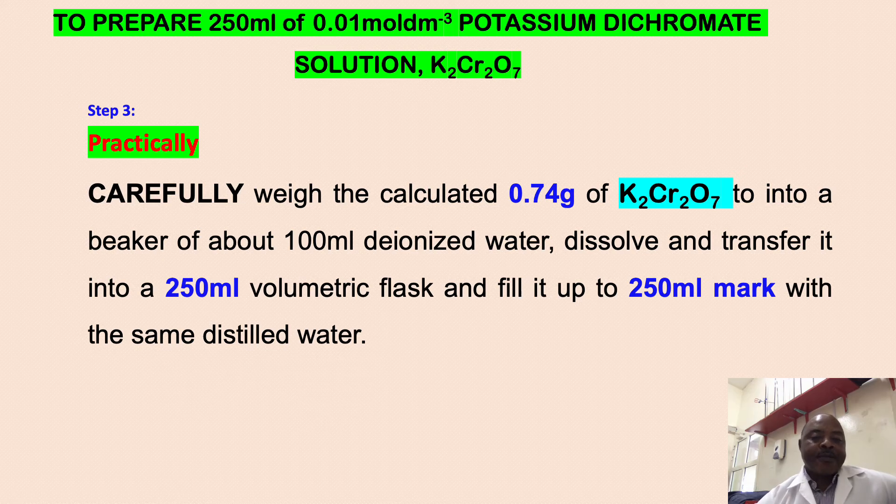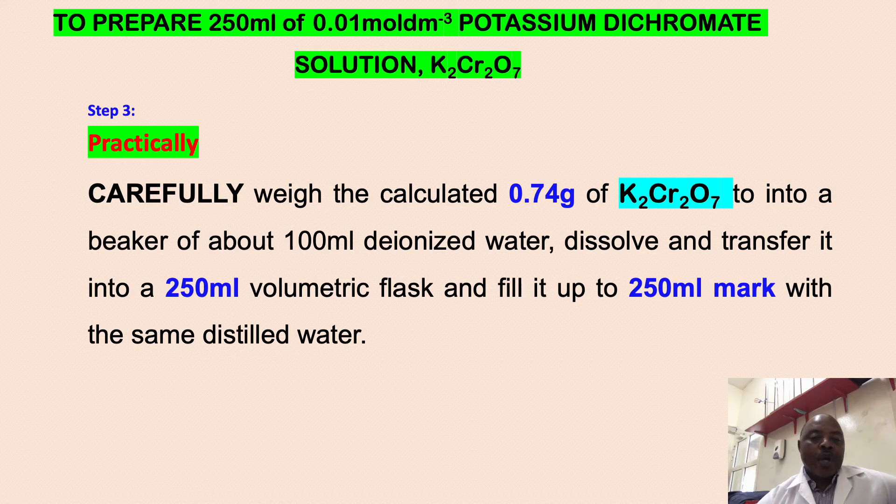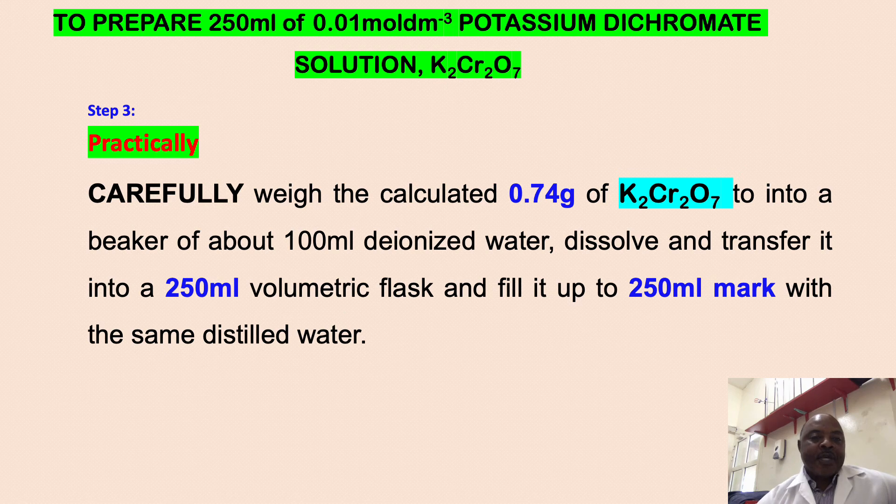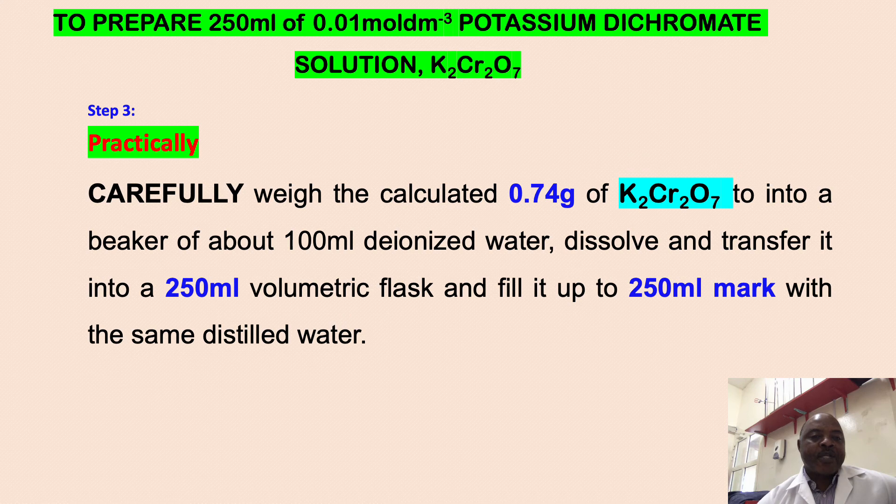Use the deionized water to fill the solution up to the 250 ml mark. At this level, you now have your 250 ml of 0.01 mol/dm³ potassium dichromate solution.